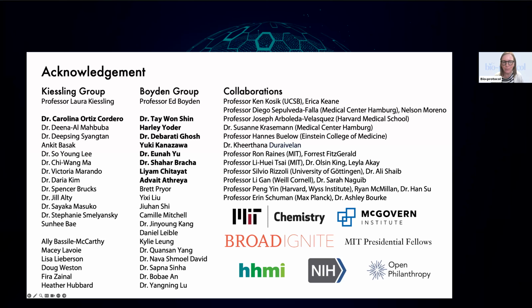Okay, Dario asks, I wonder how it expands cellular structures that were supposed to be more or less rigid, and how it will work on cellular organisms with a more complex cellular membrane or cytoskeleton. Yeah, at least with our lab's experience, we haven't really observed differences between different organelles when we expand the cell. I think the key is to ensure that you're softening sufficiently so that some things don't expand more than the others.